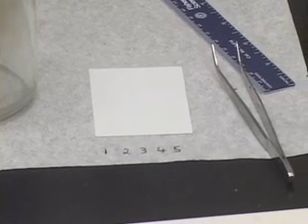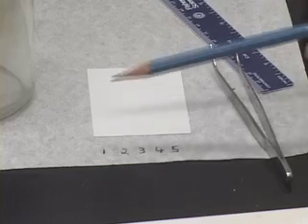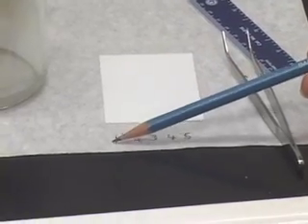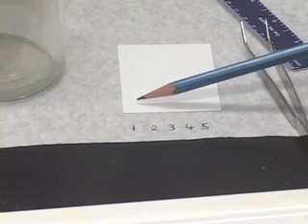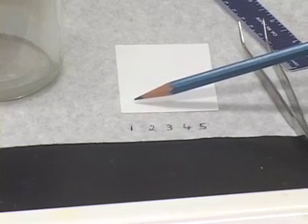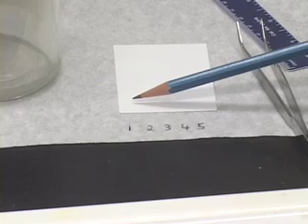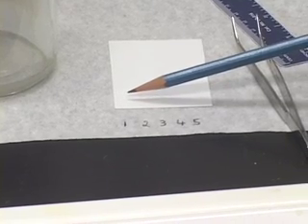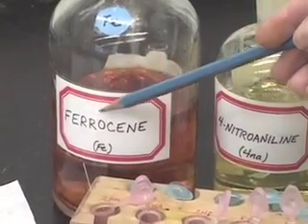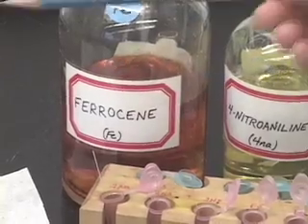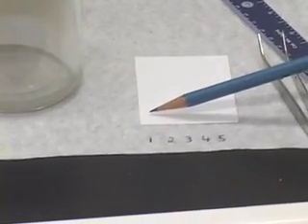What do I mean by that? At the spot labeled 1, I will spot one of the standards that was found in my unknown. For example, if I found that one of the spots in my unknown corresponded to ferrocene, then I will spot ferrocene here.